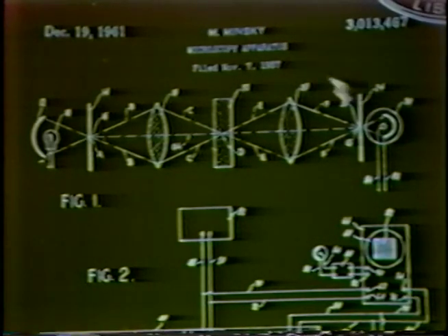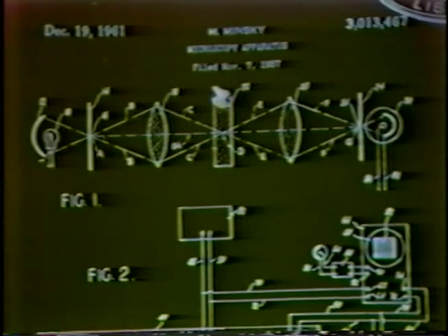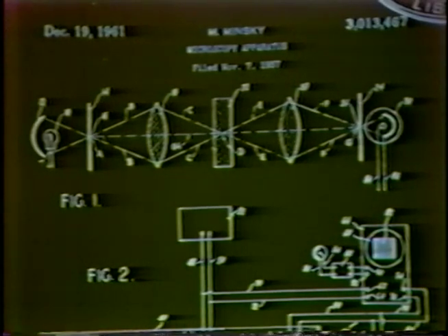which today consensus has agreed to call the confocal arrangement. It's been called other things at other times. Now, one's only looking at one point in space, so it's necessary to scan this point through the object in order to be able to build up an image.